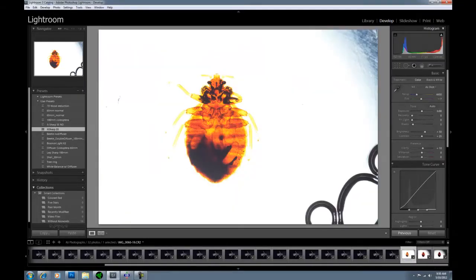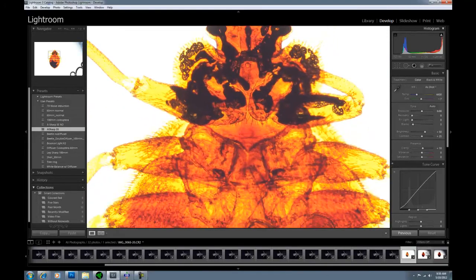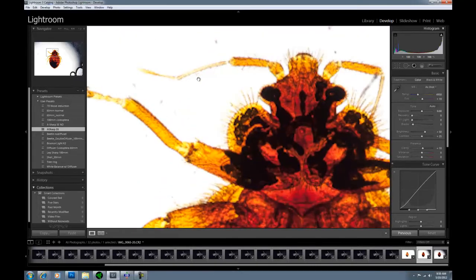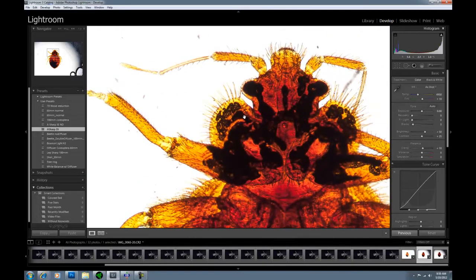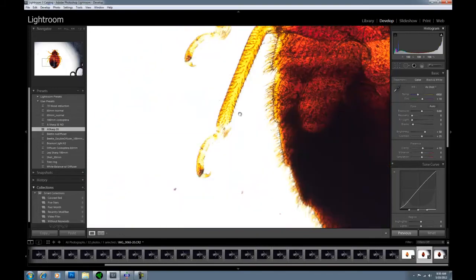All right, so I've taken three different images of the slide specimen using the SolMate. And so this one, both the aperture and light intensity controls are quite open. And you can see that the specimen is way overexposed and you really don't get much detail. Here's one with the aperture and intensity controls closer to the center, and you can see the hairs on the body and more detail, but still parts of the specimen are overexposed and you can't see them.